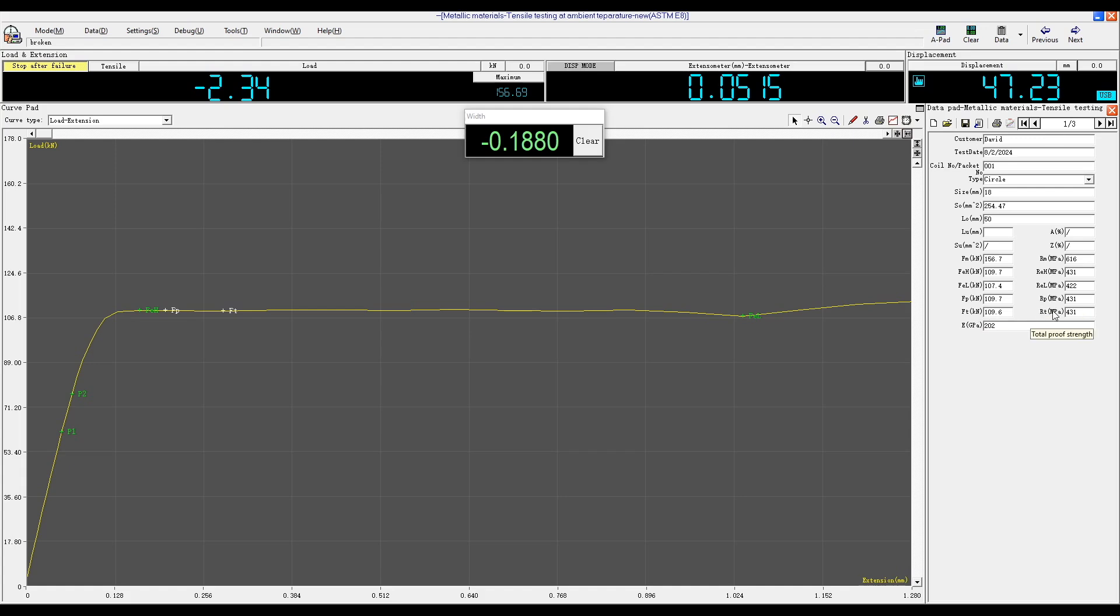FP stands for proof force, and RP stands for proof strength. You can also see the total force, total strength, and modulus of elasticity. All points are conveniently indicated on the plotted graph.